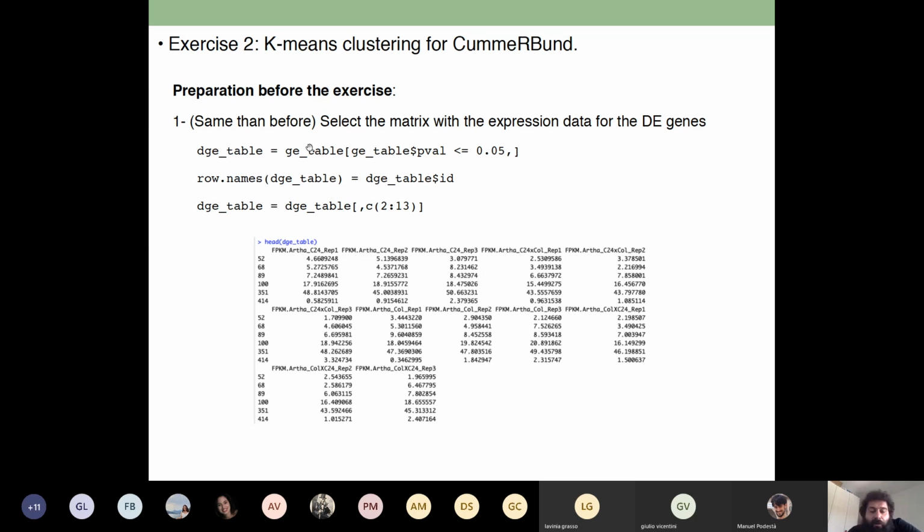I'm not sure if it's worth it to do gene ontology analysis with the data that we already have, but I will give you some insights, maybe do just one simple and quick exercise, even if we don't have meaningful results. And then I will talk a little bit about visualization, because at the end you have been using heat maps, so it's not much of a difference from the thing that we have been doing until now.